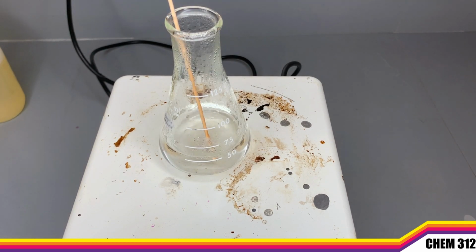So now all of our mixture is completely dissolved into our water. We can see that the water is boiling. And so what I'm gonna do is take this off the heat and remove the boiling stick. And just like last time, we're gonna watch and see what happens as this cools back down slowly to room temperature. We don't wanna cool this down too quickly. We wanna allow this to slowly cool back down to room temperature.